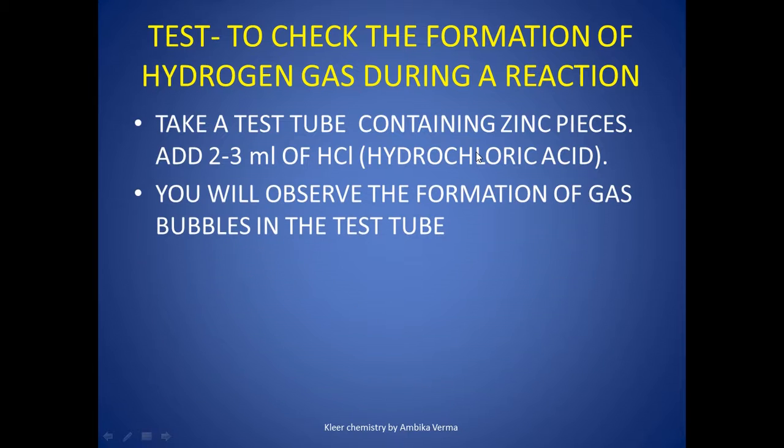Second, you will observe the formation of gaseous bubbles in the test tube.